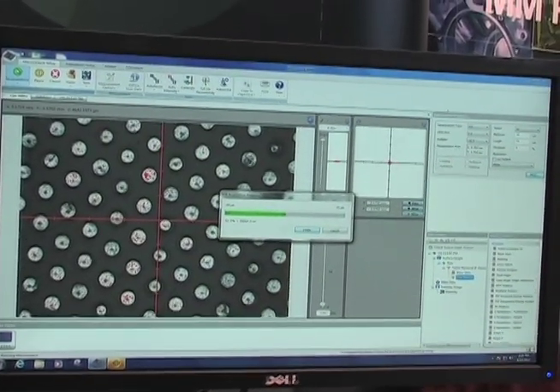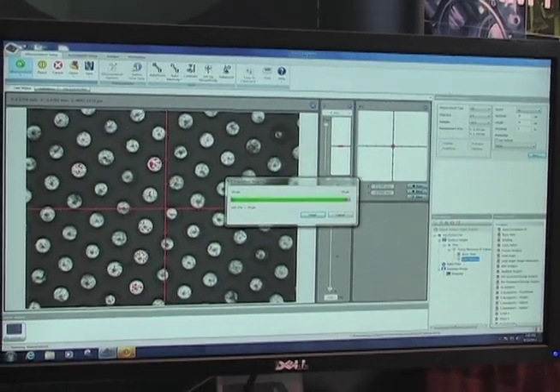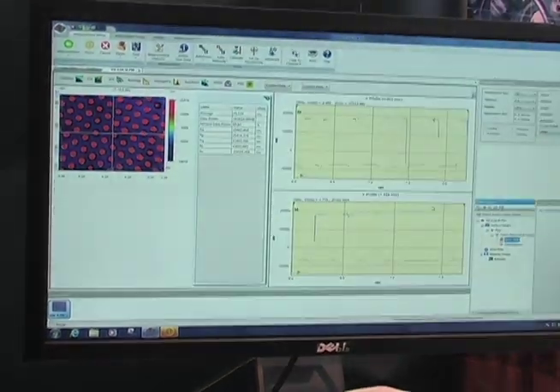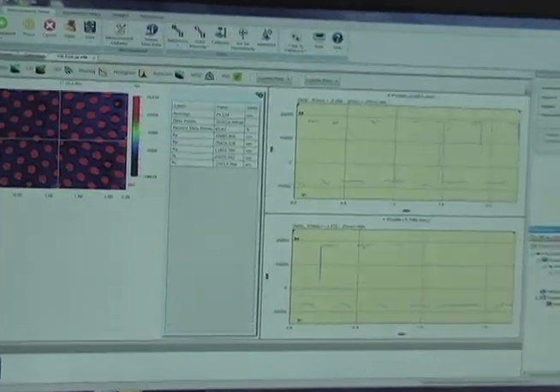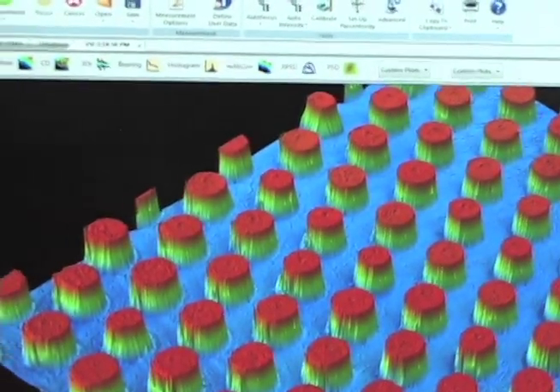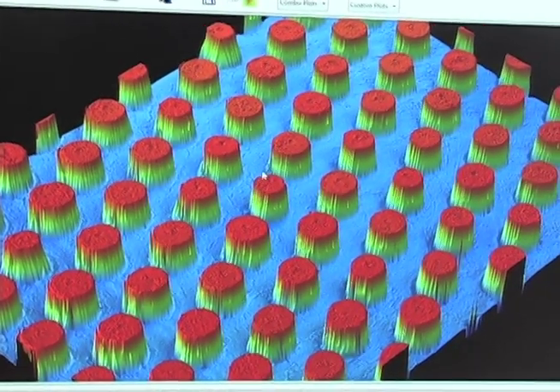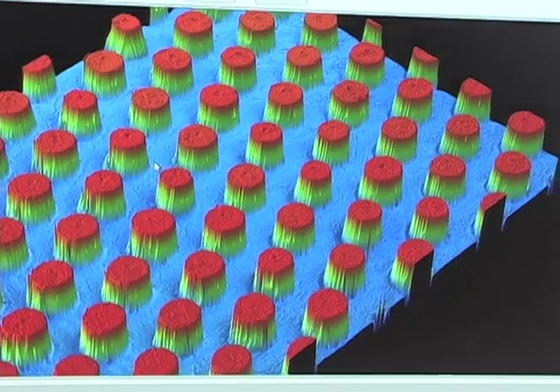Once we have that information, we have our surface patterning, our texture and our roughness, which is all contained therein. We can very easily look at the basic stats to determine that we have the roughness both on top of our bumps, between the bumps, and then the total surface roughness as well.